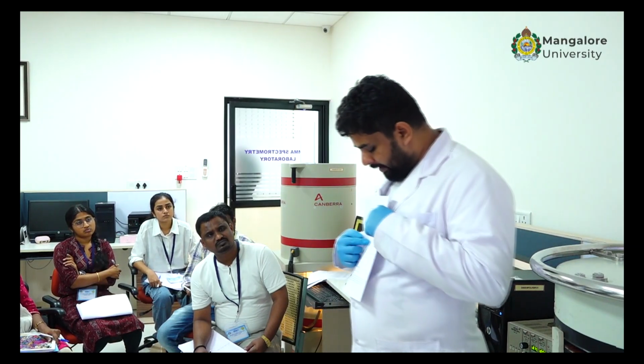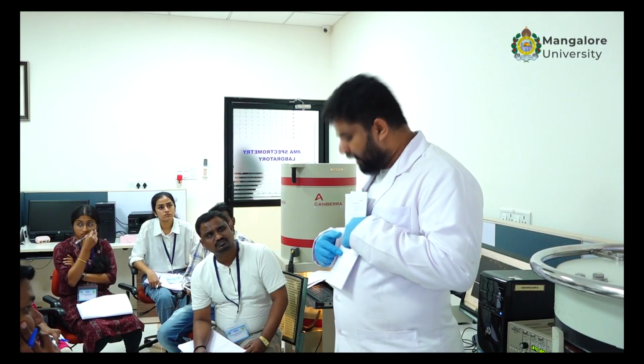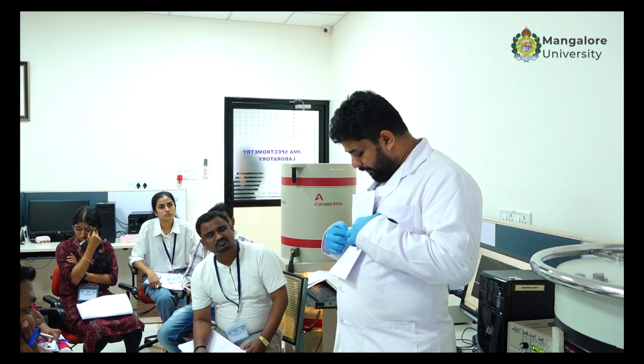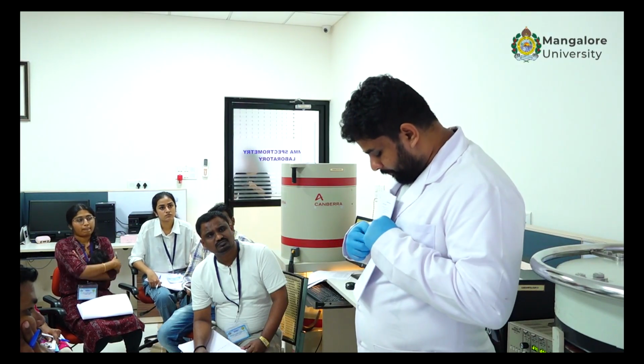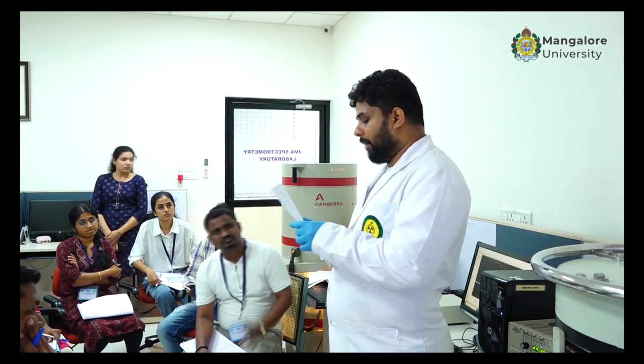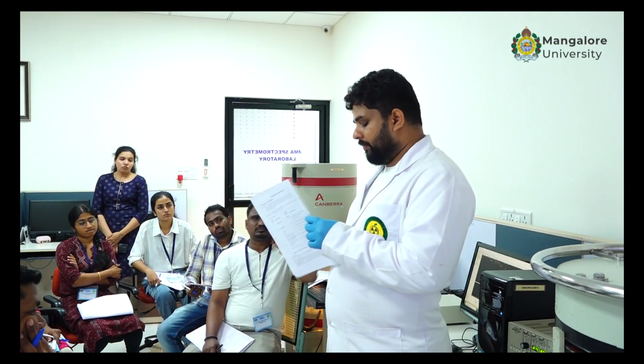3, 4 are sediment samples. One is sediment and another is bauxite. And 5, 6, 7, 8, as discussed earlier, are swipe samples. Sample number 5 is our sample that has to be analyzed. 6 and 7 are QC, 1 QC for cesium, 1 QC for strontium, and 8 is a blank sample. Okay, so this is the sample description, and we have to analyze.